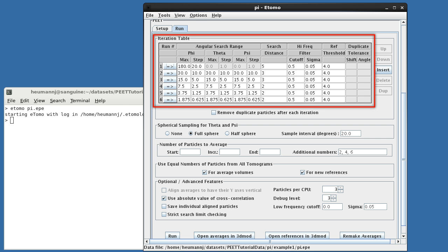Phi, theta, and psi specify angular search ranges around the particles y, z, and x-axes respectively. For each angle, a search will be performed from minus max to plus max degrees, in increments of psi's step.